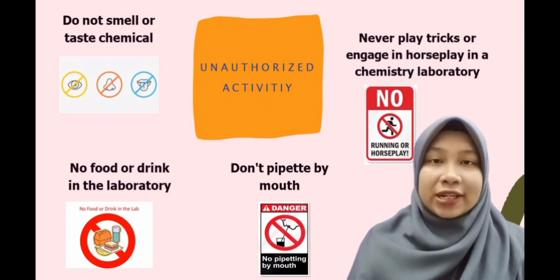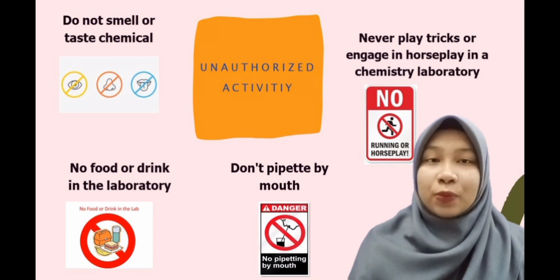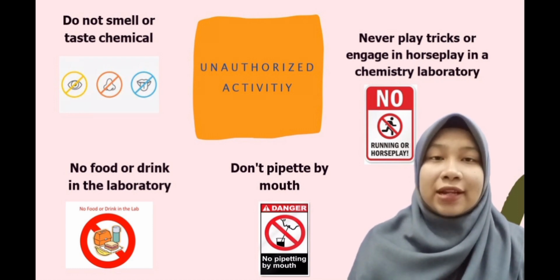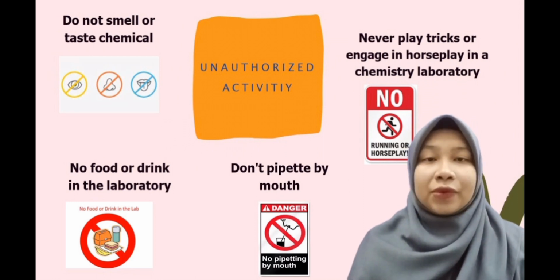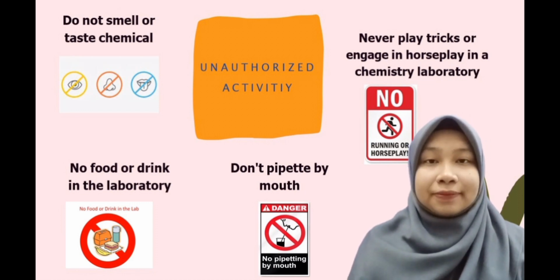Consuming food or drink in the lab can pose too many hazards. It will increase the risk of exposure to hazardous materials and potentially attract pests like cockroaches and rats. Students also are not allowed to pipette by mouth or smell or taste chemicals. Some chemicals with strong odors may cause eye, nose, or lung irritation.